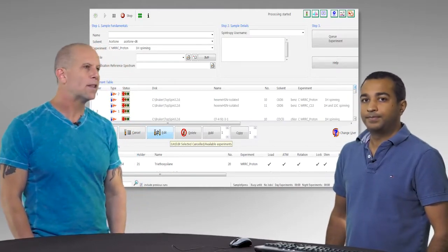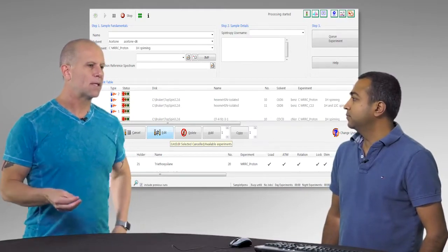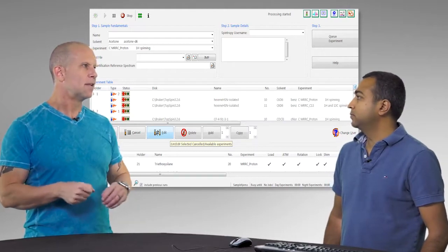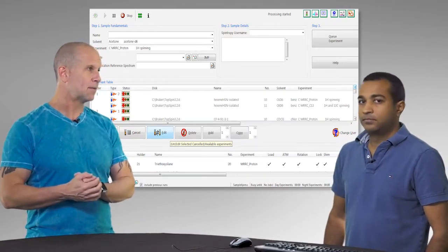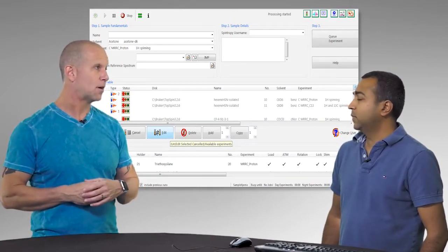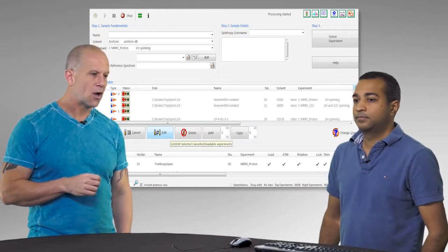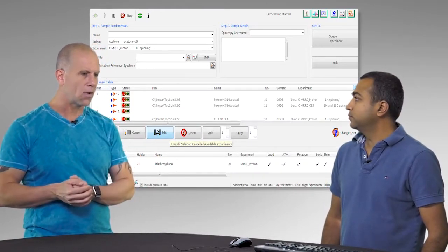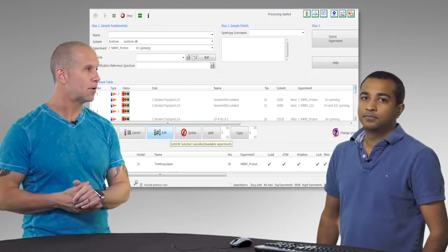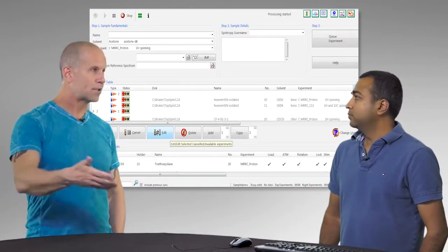Right. And with these walk-up or fully automated instruments, the norm has become for students to go in and use this completely automated system to take their samples for running NMR. Most of the work in setting up the sample is really sitting in front of the computer, making sure everything's entered and the computer knows what to run.